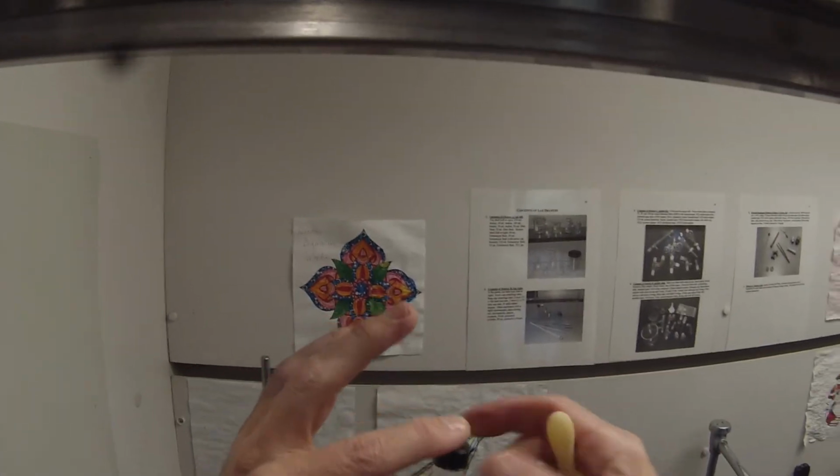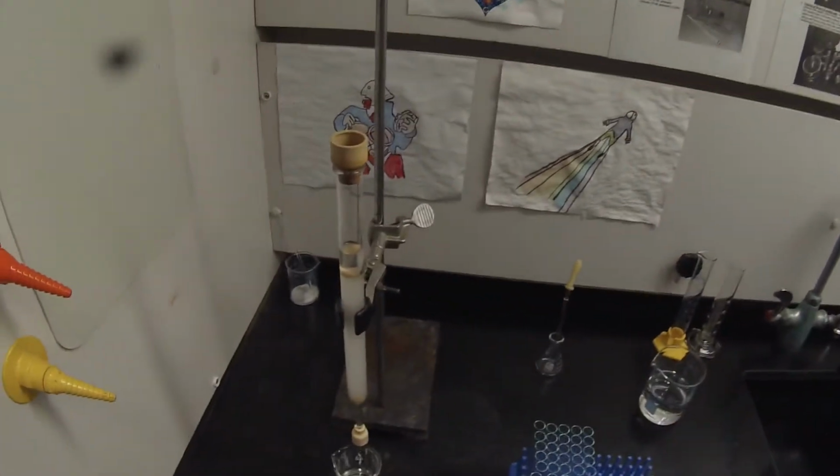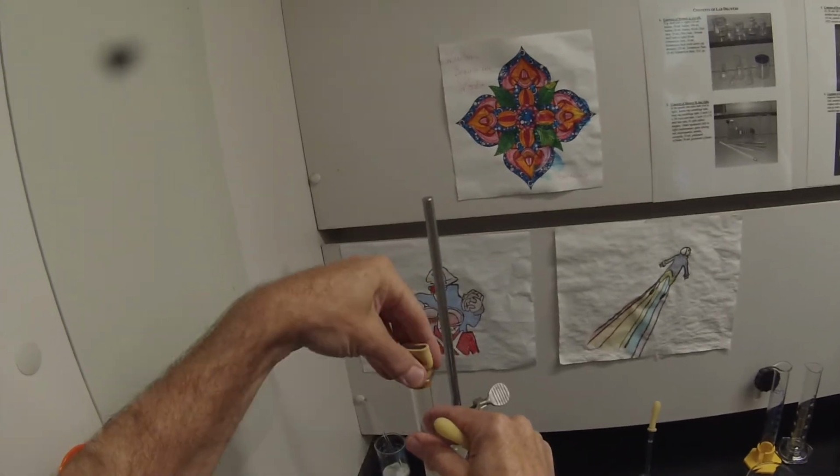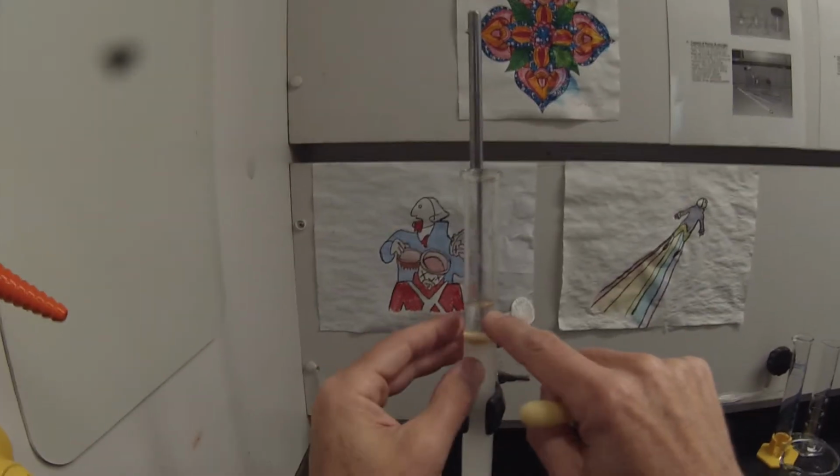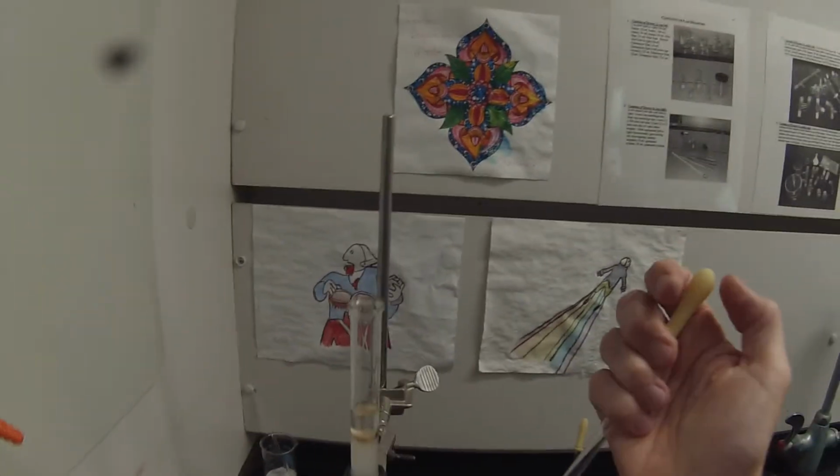I'm not overly worried about that. We'll let that sit a little bit. So before I can load the column, I need to let the meniscus here, I want the bottom of that meniscus to be right at the top of the sand.